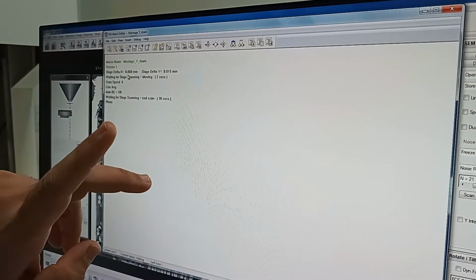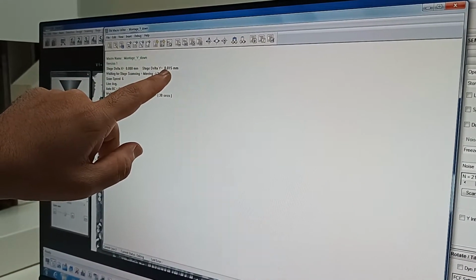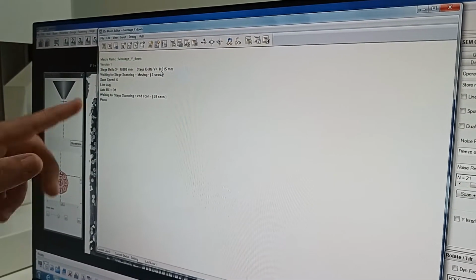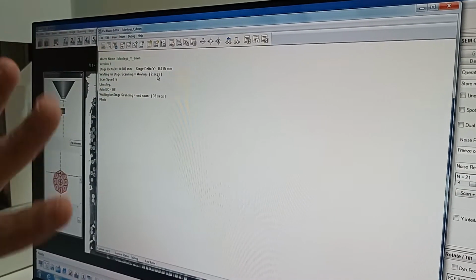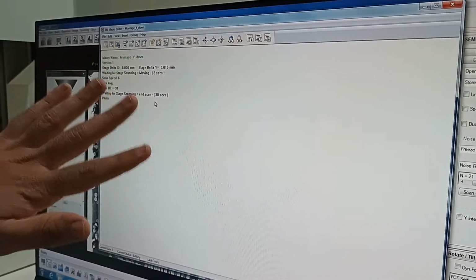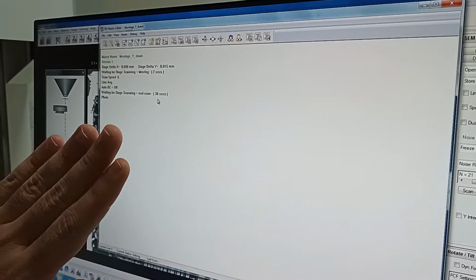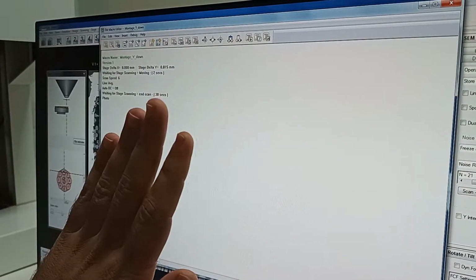So we have to edit two things here: one is plus or minus, and the other is the value. And this should stay as it is, 0 only. Next thing we will see is that it will wait for 2 seconds. Although it takes some milliseconds to move the stage, we wait for sufficient time so that it has moved and there is no vibration disturbance or something like that. So we give sufficient time to move and settle down.